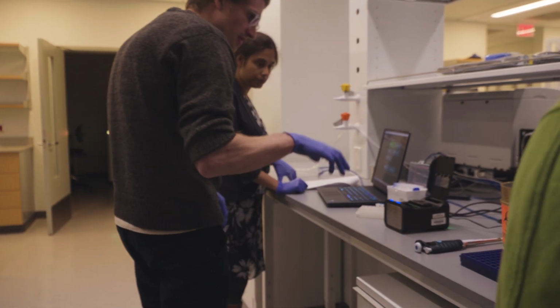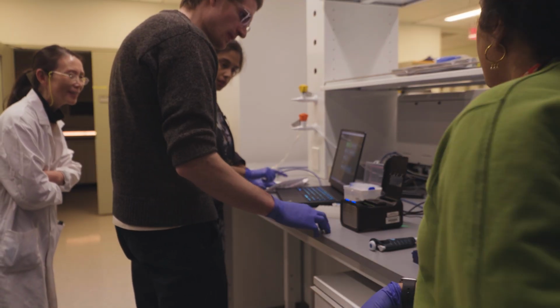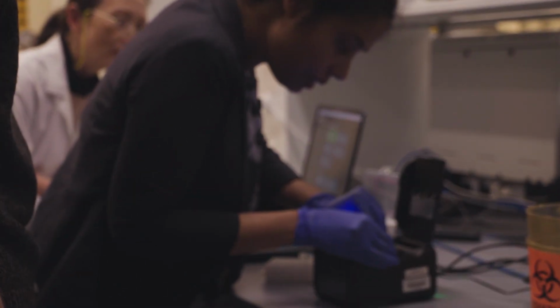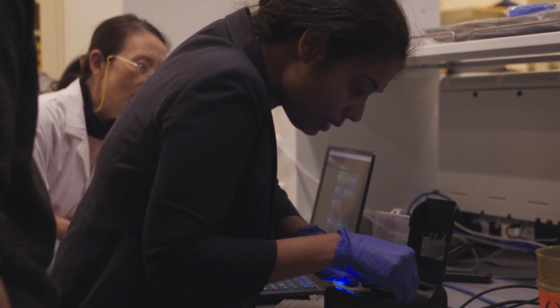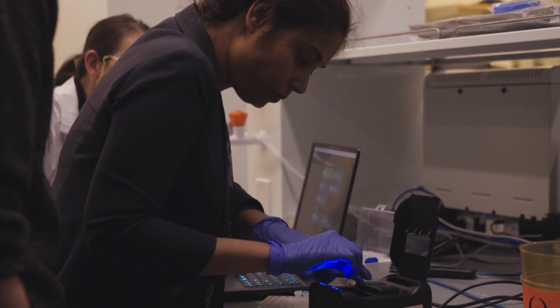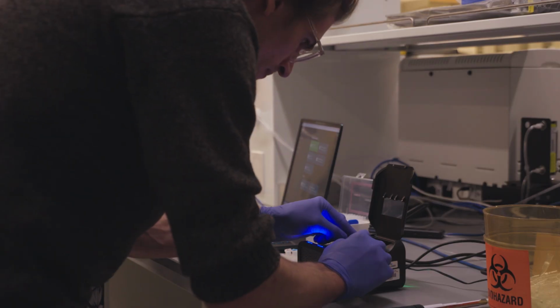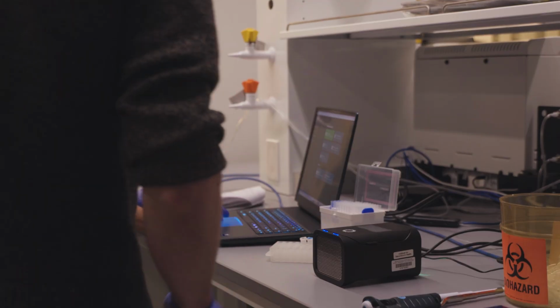Might have to check those. They seem good. Yeah, this is the way. Pressed down enough. I felt this one was a little bit problematic, but I think it's okay. I think this is how the light shield is made. Because this is not the smooth side, right? Correct, that is the rough side, and that's how it should be. So shut this, and then you can do it.